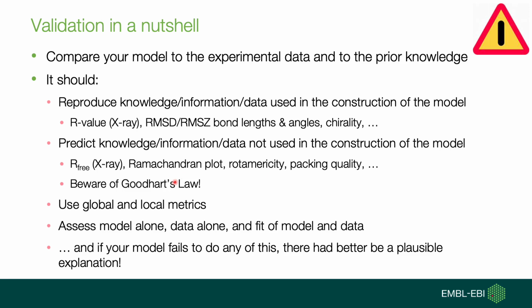It's good to use global and local metrics. Global metrics to assess the overall quality, local metrics to look at the details. And it's good practice to assess the model alone, the data alone, and the fit of the model to the data. And so if your model fails to do any of these things, you better have a very good explanation.